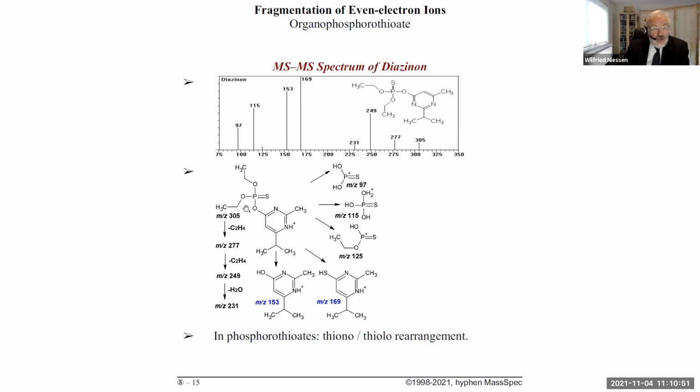And sometimes I say, well, what we have is, upon fragmentation, we do some wheel of fortune here. For some fragments, it's the CO. For some other fragments, it's the CS. And of course, it's something weird going on here, but you see it with a whole variety of compounds.